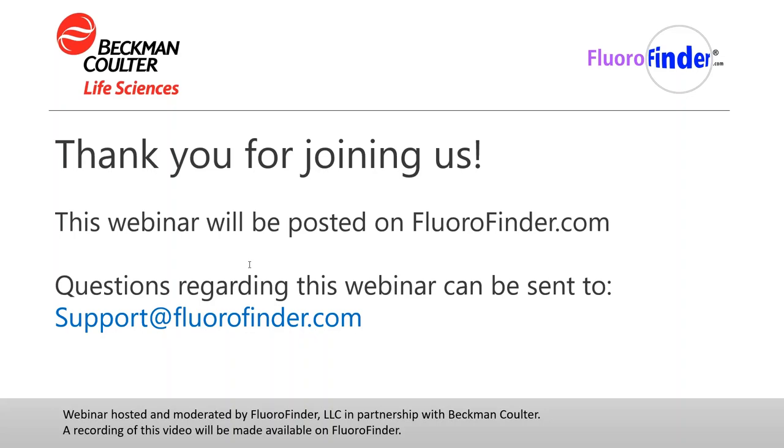Okay, great. We have a question here from Jen asking, do you see the flow cytometry allergen test replacing the skin test? And do you anticipate educating clinicians to interpret the results?